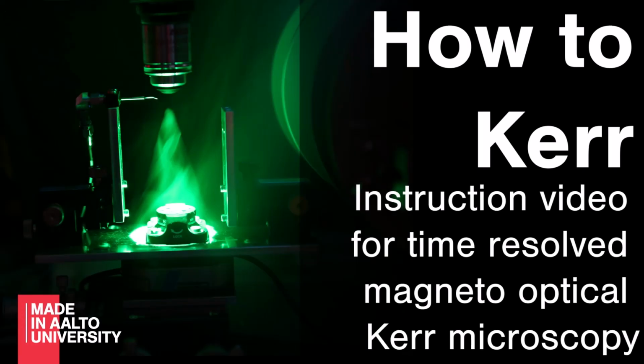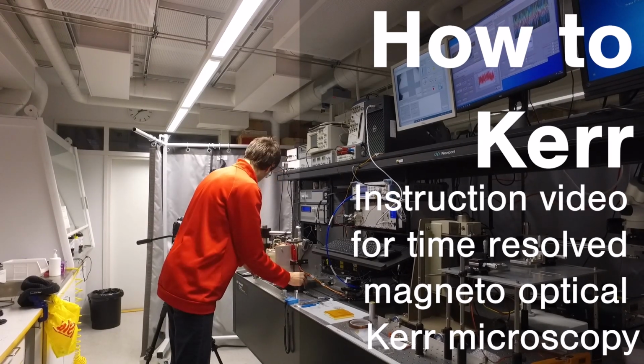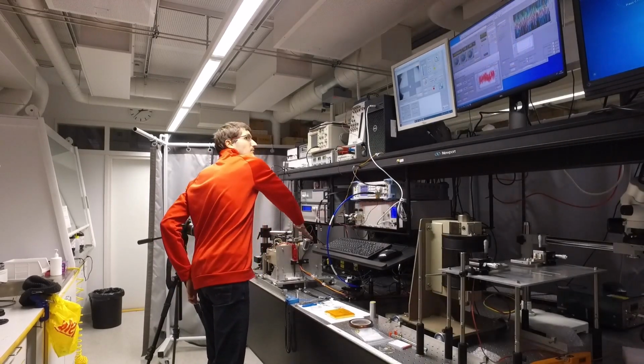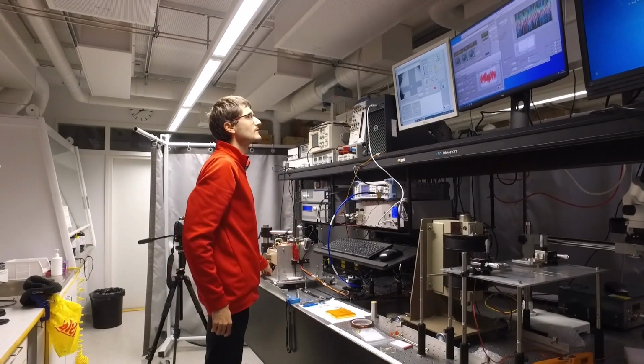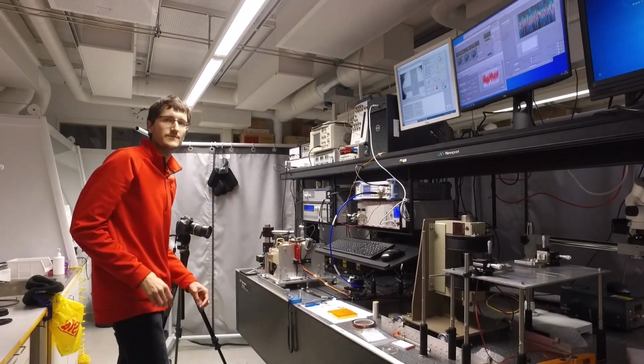Welcome to the MOKE instruction video. The purpose of this video is to show you how to measure in a time-resolved fashion. I will walk you through the very elementary basics of the method, then I will make a very rudimentary measurement, and in the end I will show you some exemplary studies that can be performed with our home-built system.